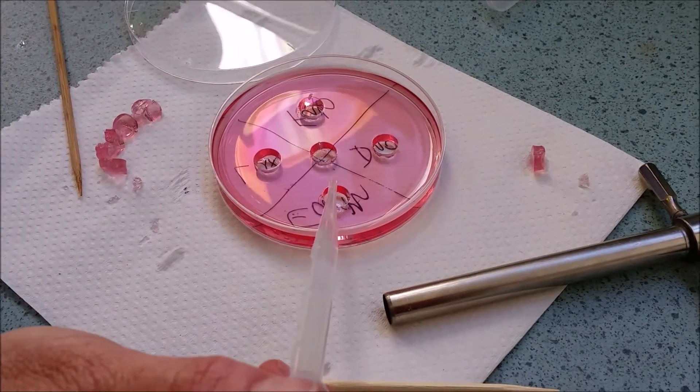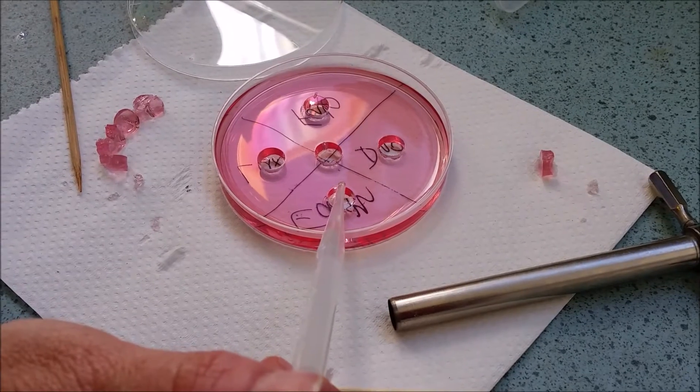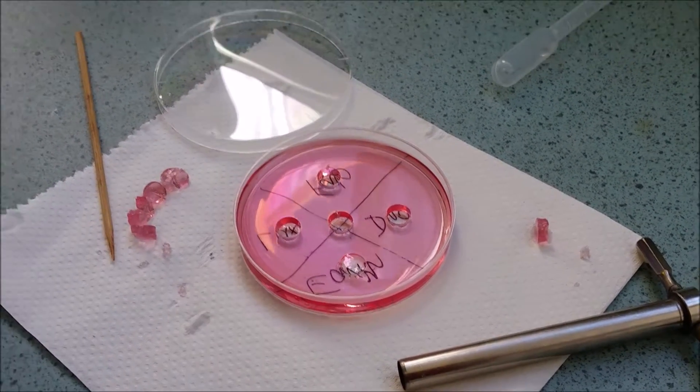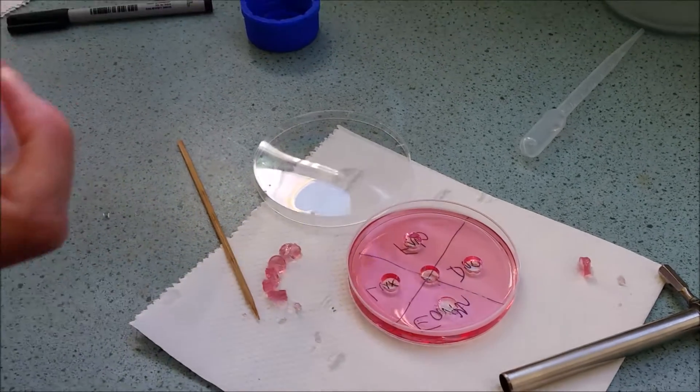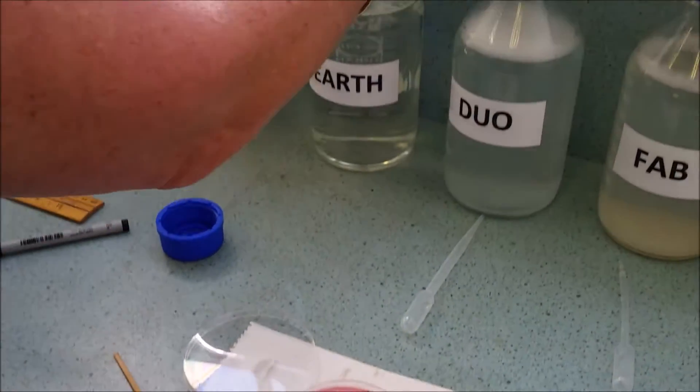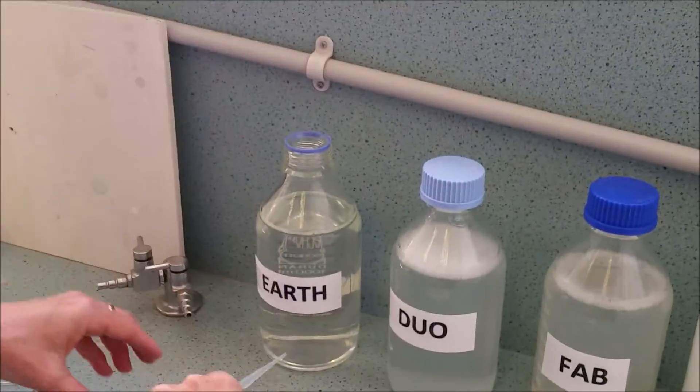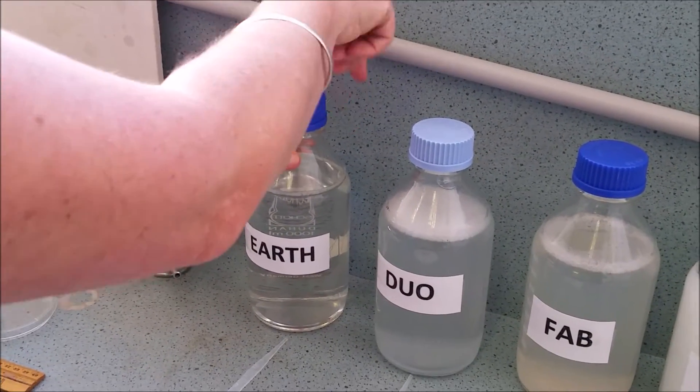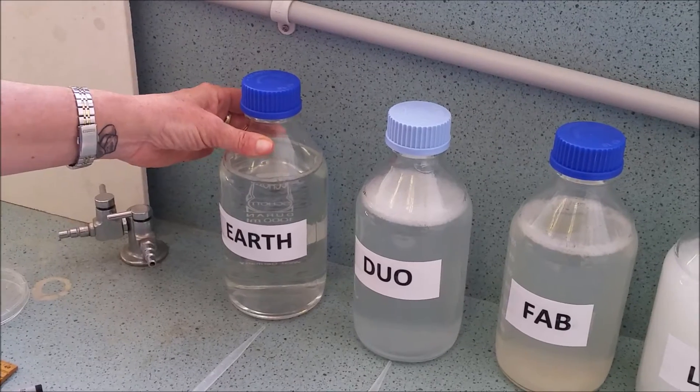You only want to have approximately four or five drops. One, two, three, four, five into the well. It hasn't leaked, it hasn't bleached out anywhere. Go straight back in and place directly in front of the bottle. The lid's gone back on for the next person.